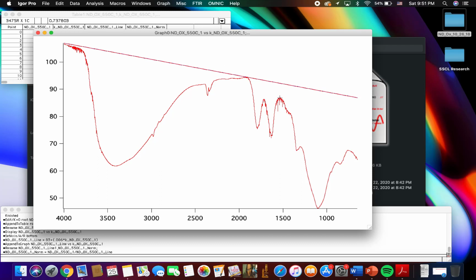And it looks a little better if you connected from the 1500 to the 2000, or you connect the middle points basically versus this longer point over here. Or sometimes it's better to have the 4000 a little bit off and your 1500 number a little bit off, like having it float right here and then having this float right here. Again, it all depends after you make your KM transform.